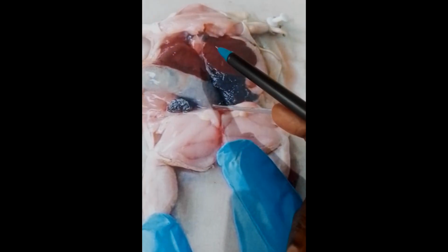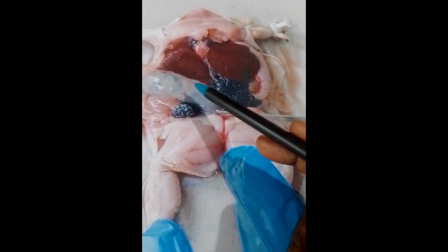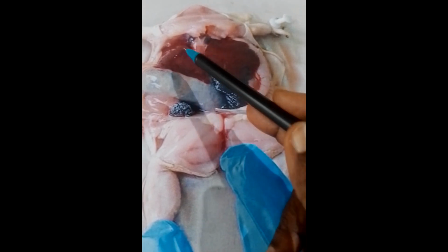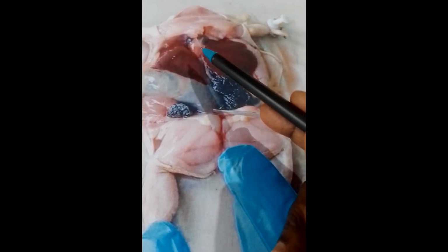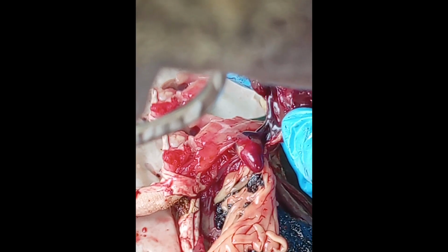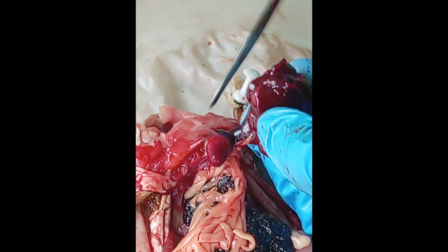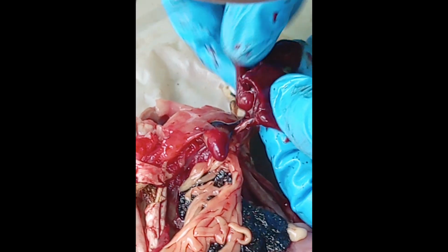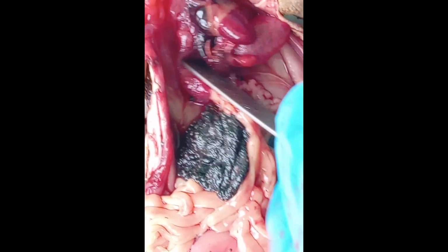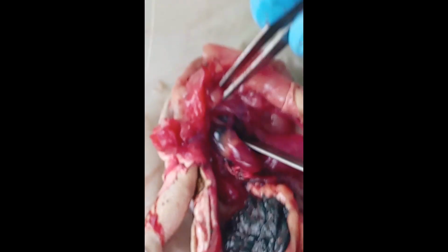It's clear. Now, if we remove these liver lobes and the stomach and the other digestive organs, like this colon, we will see the heart and the lungs very clearly. So they have a clear cavity. Now, I'm removing the liver from there. Then I'll also remove the other structures in the abdominopelvic region. You see here, that's the lung, another lung, and that's the heart there with the blood vessels on it.